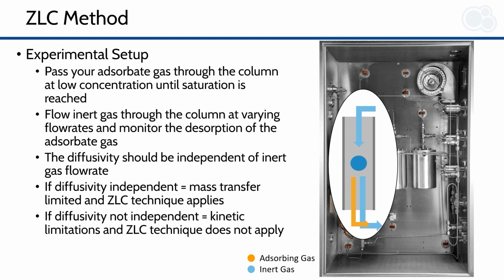So if there are strong adsorption interactions or kinetics in this process, you're not going to be able to get accurate diffusional data because there are going to be other components contributing to how fast the desorption process occurs that will limit the applicability of this technique.